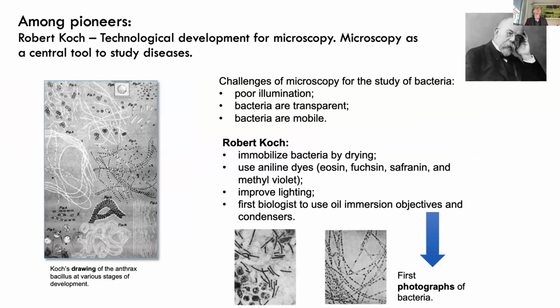And for instance, here I would like to introduce Robert Koch as a pioneer of this. He's a great competitor of Pasteur. But this fantastic researcher actually made crucial advances in microscopy for imaging diseases and infectious diseases in particular. Even as a medic, he recognized the importance of visualizing the effectors of diseases, that is pathogens, and typically bacteria. He made plenty of technological advances that are quickly described here. And for instance, his lab is credited with the first photographs of bacteria, not only drawings, right?